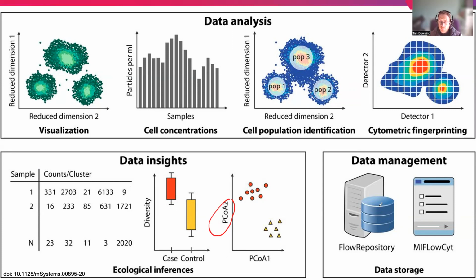And then there's also this idea that we have to manage our data more effectively. That means uploading it to repositories, backing it up when we need to for our own work, and making sure that it's accessible for other people in our own lab, but also the community more widely.